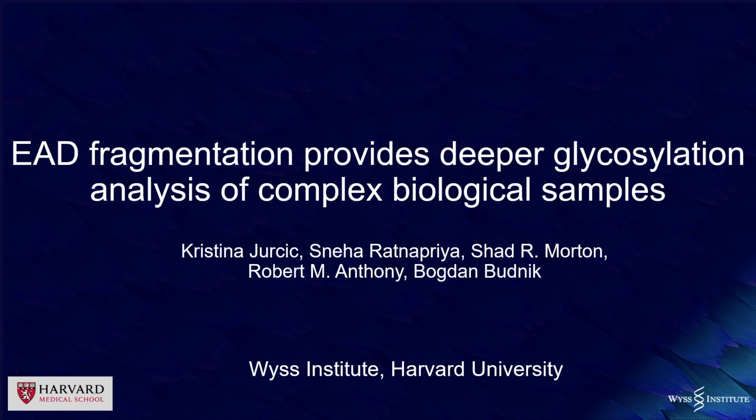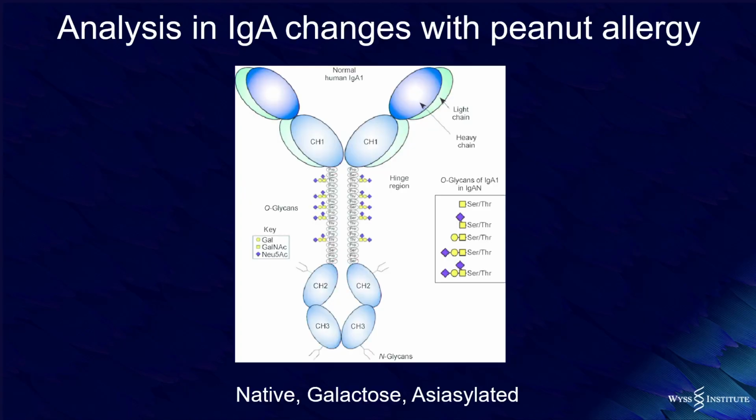Okay, I think the main idea is just to show how the EAD on the instrument works. And that's about a year that we have the instrument in the lab. Now I don't need to show you this anymore because it's already been introduced why it's important and where they are. Basically, they're in our blood.